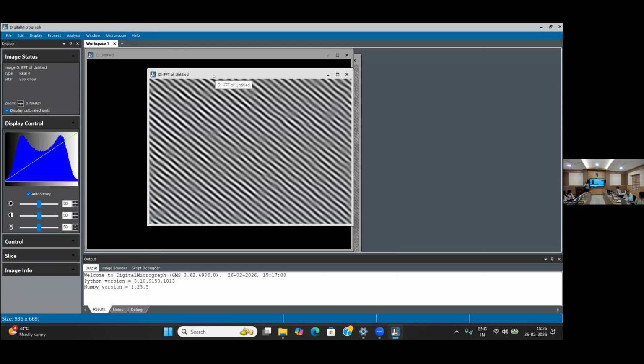Yeah, we will prepare your sample from outside. We took the grids and we prepare and we will analyze. We will send you the result. And during analysis, you can sit with us and you can see what is happening there. You can select the region. You can see what are the other possible areas.